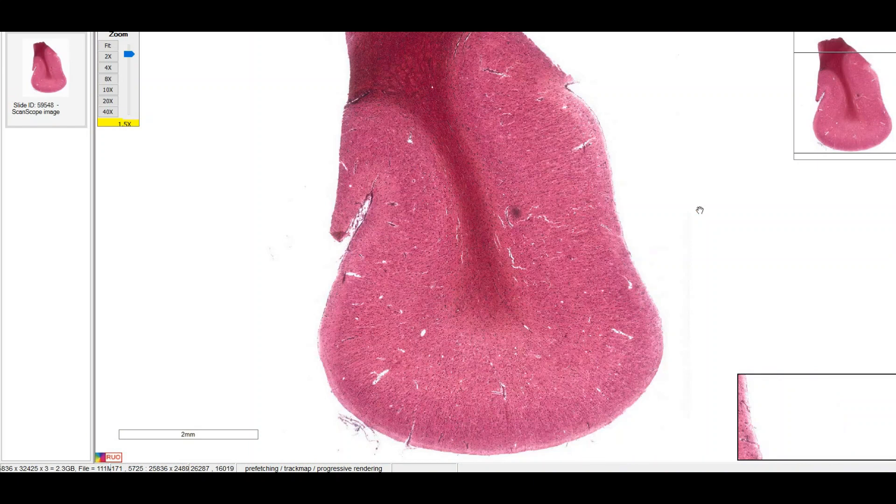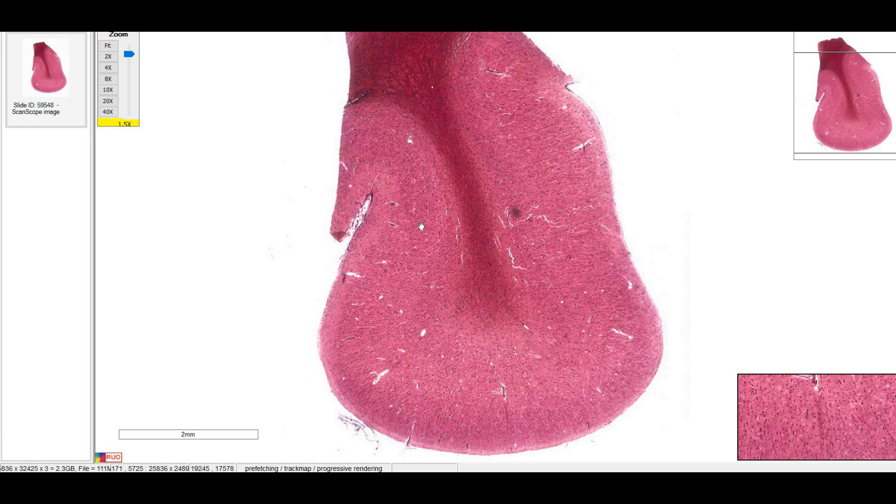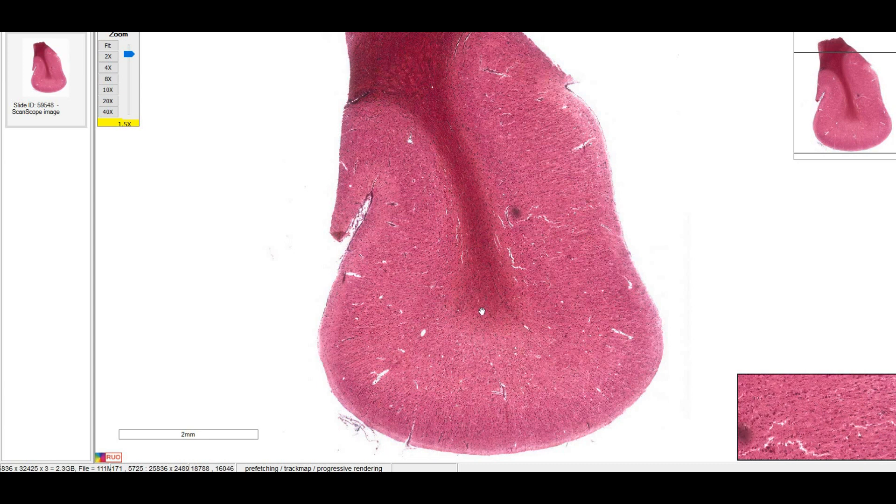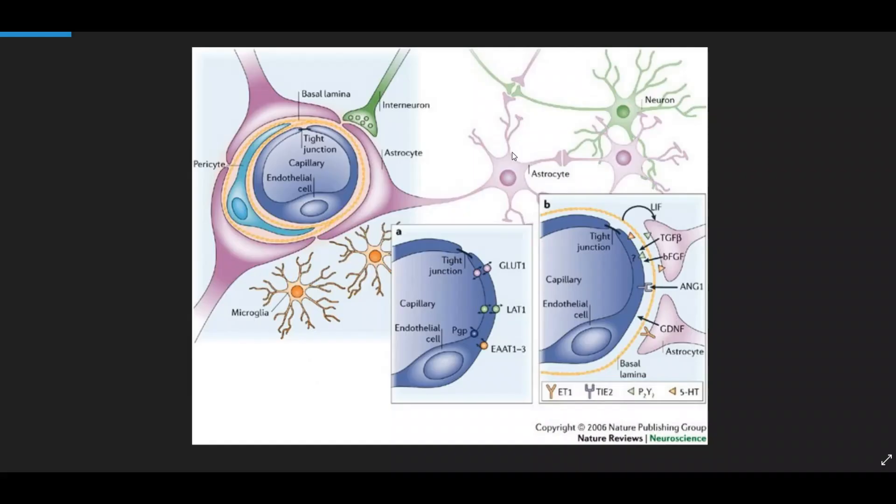This next slide is good for looking at astrocytes. This is a piece of the human cerebral cortex. This lighter staining area here is the gray matter, and the darker staining area is the white matter. Remember the astrocytes are glial cells that are kind of star-shaped. They have lots of these cellular processes. One of the jobs of the astrocytes is to make part of the blood-brain barrier.